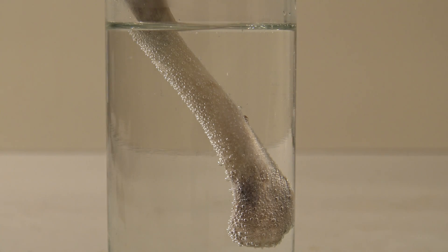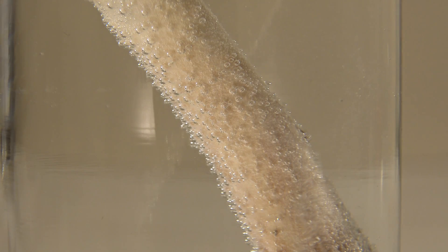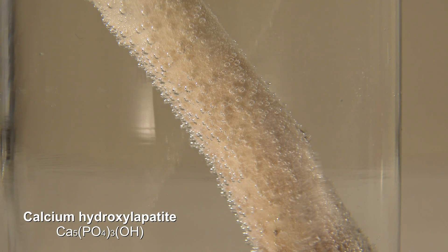After a short while bubbles of gas could be seen on the surface of the bone, which were air that was released and carbon dioxide. So it's possible to guess that bones are mainly calcium carbonate. But this is only present in very small amounts. The main part of the calcium lattice is calcium hydroxyl apatite.